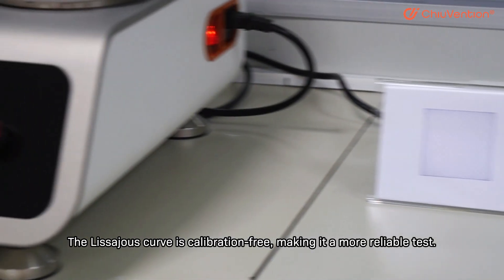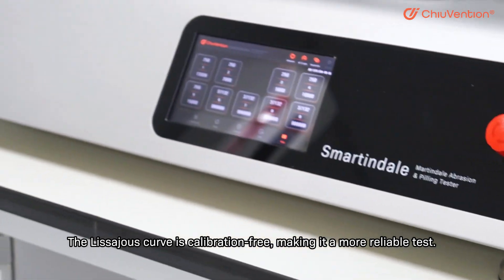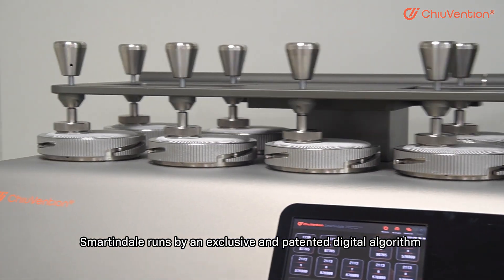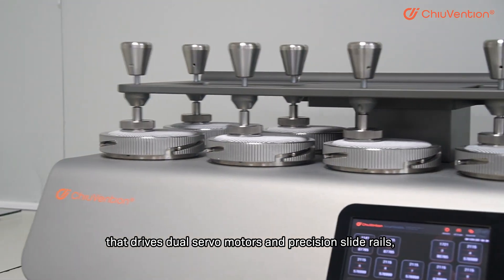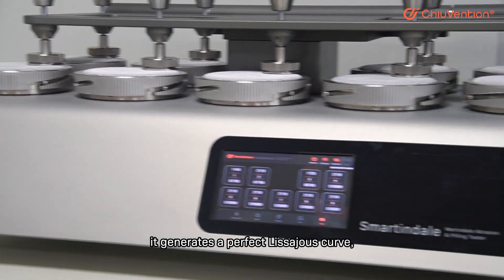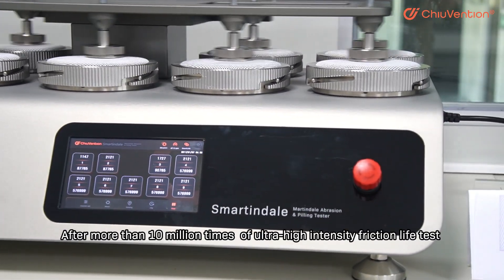The Lissajous curve is calibration-free, making it a more reliable test. Smartindale runs by an exclusive and patented digital algorithm that drives dual servo motors and precision slide rails. It generates a perfect Lissajous curve.